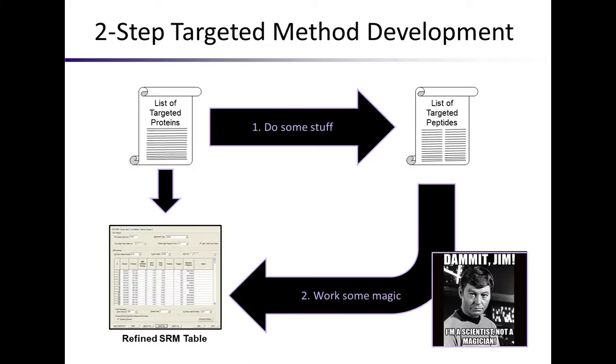And so we're going to talk from here toward the end about different ways to develop a targeted proteomic method, specifically quantitative targeted proteomic methods, okay? And I'm going to show you how to do this in 2 easy steps.